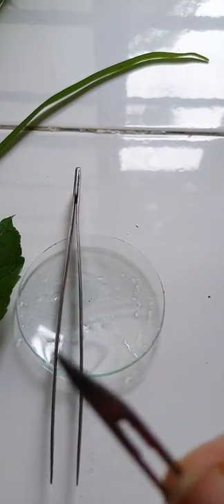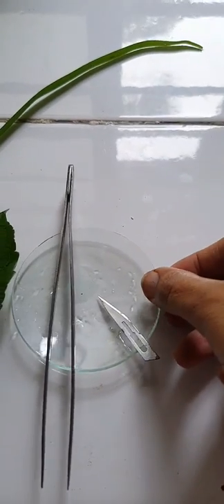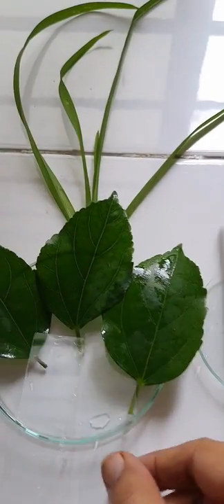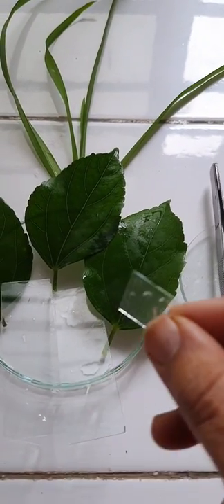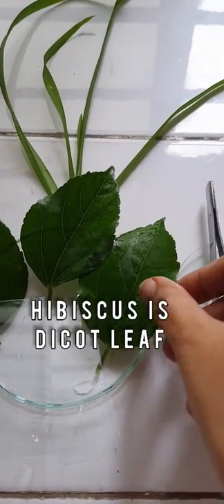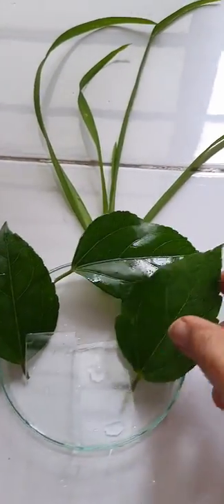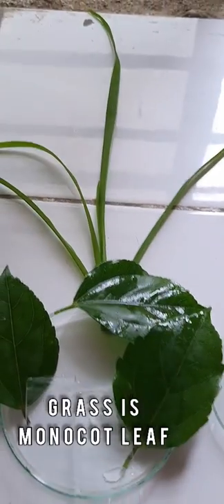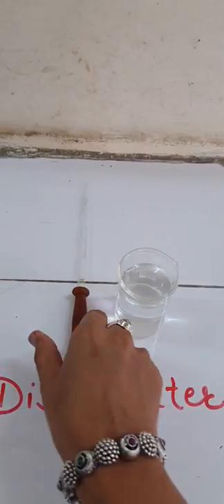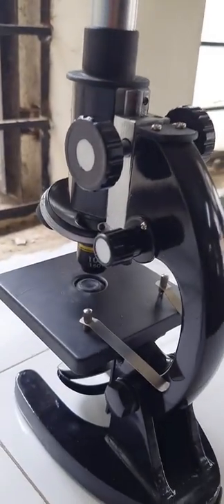For this we require a blade, forceps, petri dish, slide, cover slip, clean and fresh hibiscus leaf, grass, distilled water, dropper, and compound microscope.